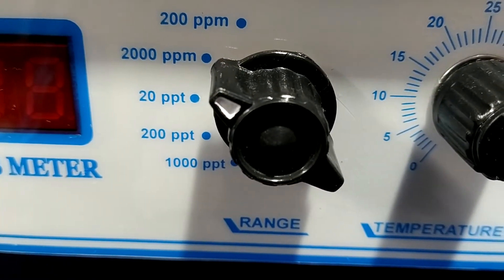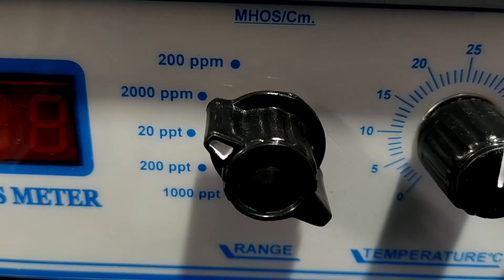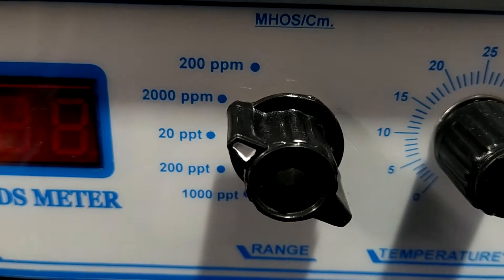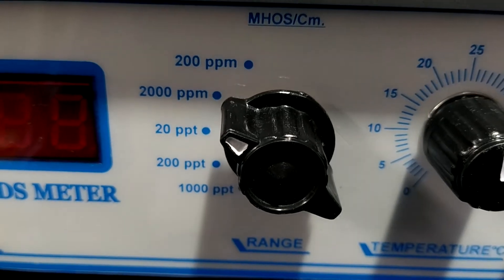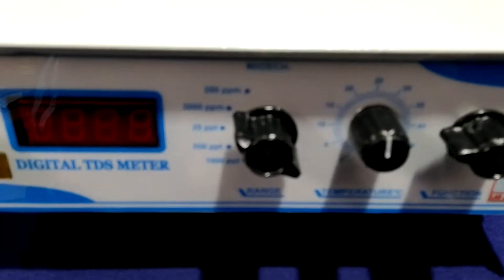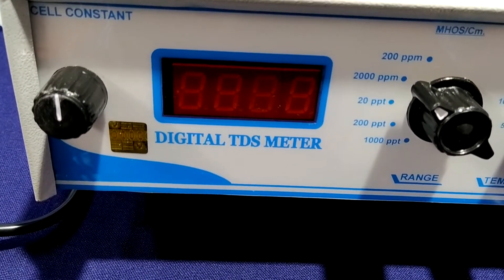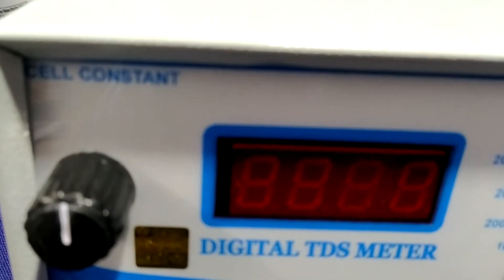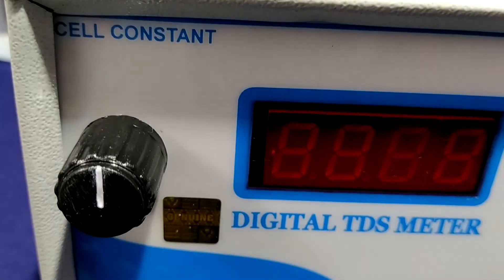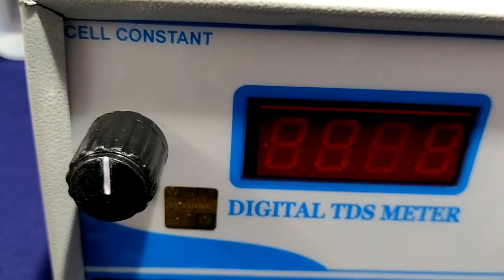It has ranges of 200 ppm, 2000 ppm, 20 ppt, 200 ppt, and 1000 ppt — five ranges are available. The last is the cell constant function for feeding the cell constant of the conductivity cell or feeding standard solution values.